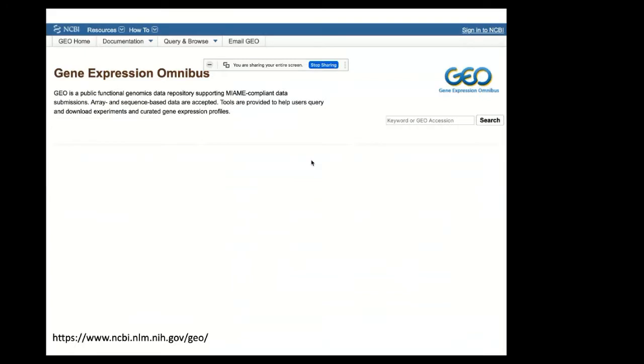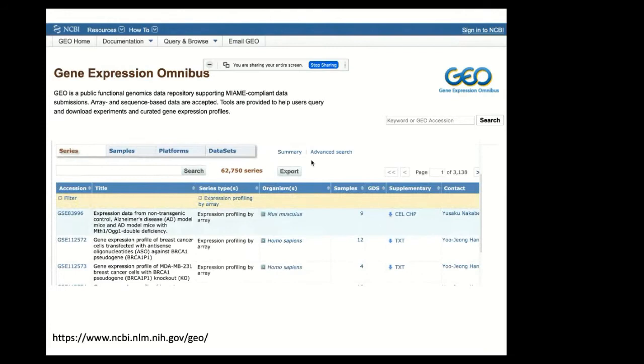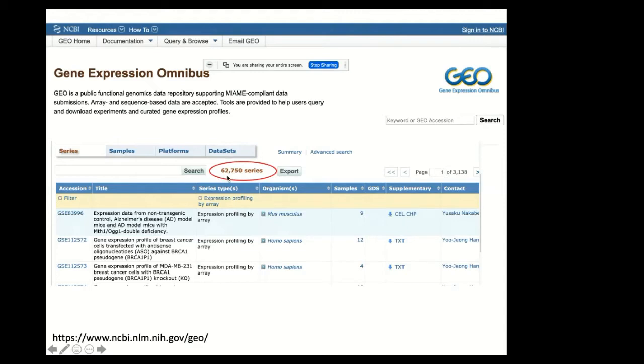People are probably familiar with GEO, but for those that are not, it's a public repository of gene expression data. The focus for ShinyGeo is going to be on microarray data or data that's obtained through expression profiling by array, and what we can see here is just the huge number of data sets that are available. Over 62,000 microarray data sets are on GEO, and the goal of ShinyGeo is really just to make this data more accessible to researchers who don't necessarily have a programming or bioinformatics background.